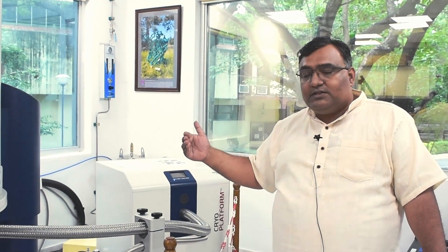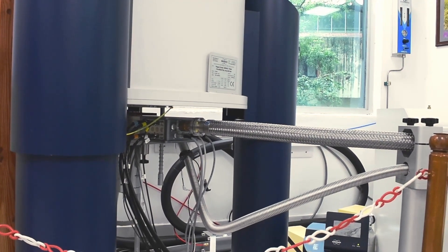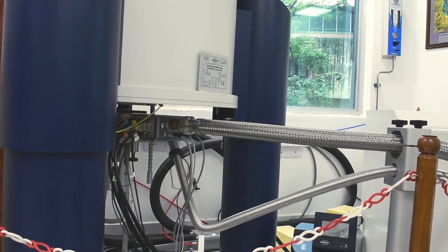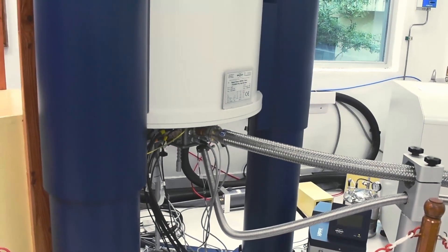Cryogenically cooled probe enhances the sensitivity almost by 8-fold and there is a coil that is giving the radio frequency pulse. And that occurs at 17 Kelvin. So this is an example of extreme engineering.